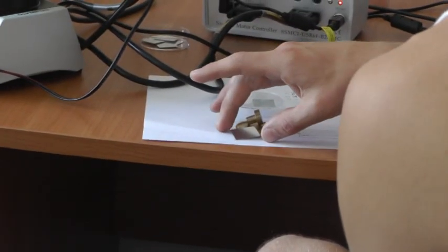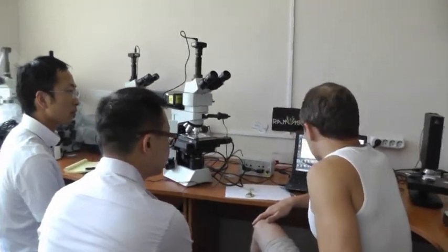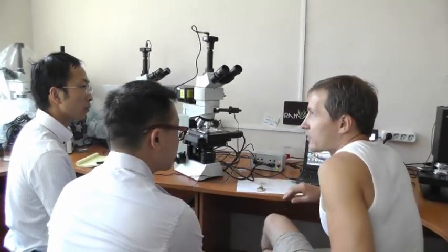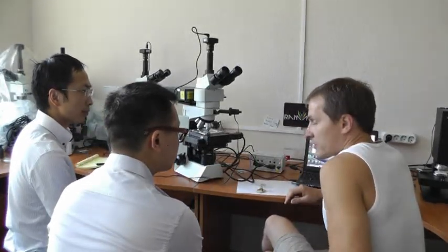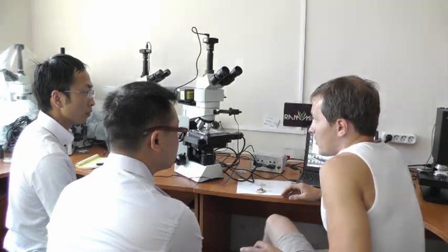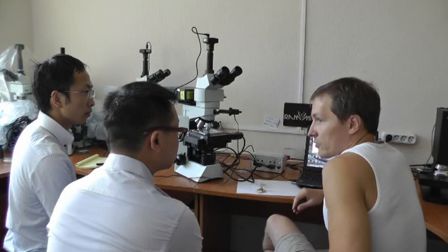So just glass would not work? It would work, but glass also has some weak Raman signal. Okay. It is located on the left side of the spectrum, no more than 1,000 reciprocal centimeters, and you will see organic Raman spectra superimposed on glass.